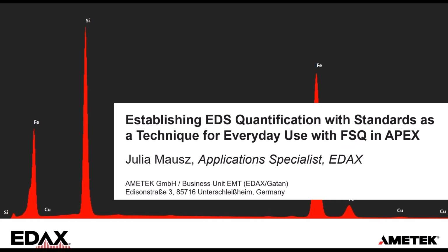As already mentioned, today I'd like to talk about EDS quantification, especially with standards, as a method suitable for everyday use.